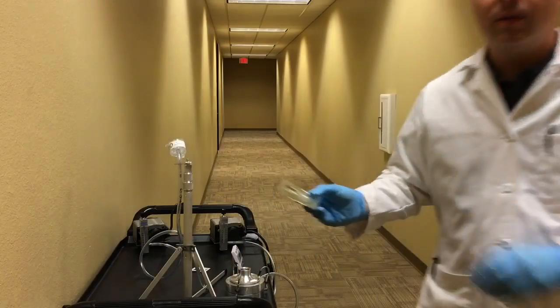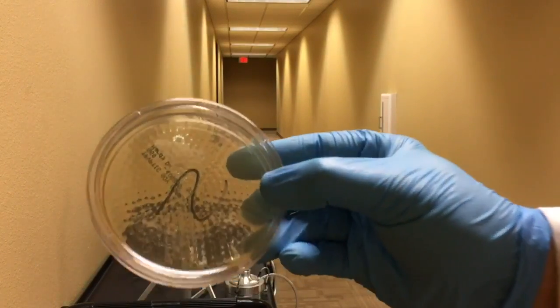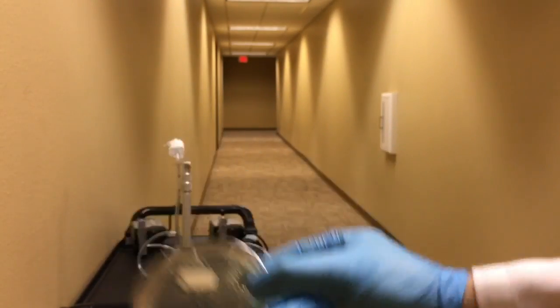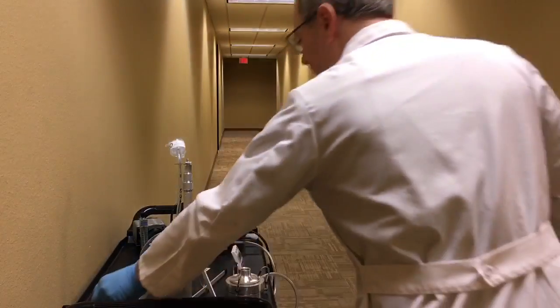Here is an example of a plate that has gone through the Anderson capture system. You can see the impaction holes, which increases the chance that the fungi will grow into colonies.